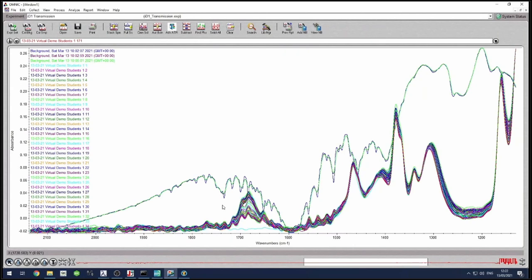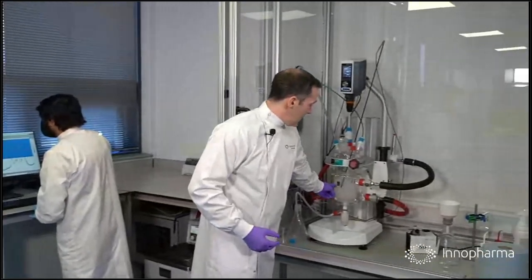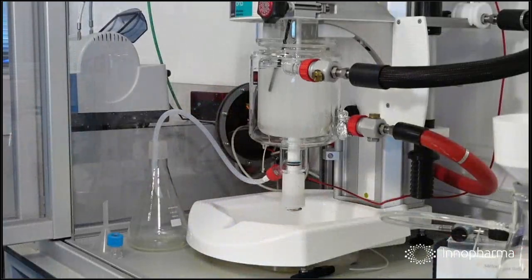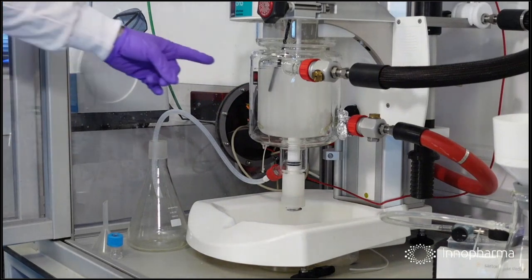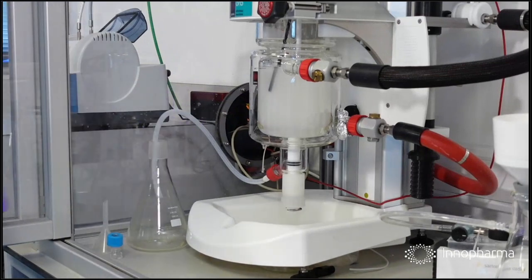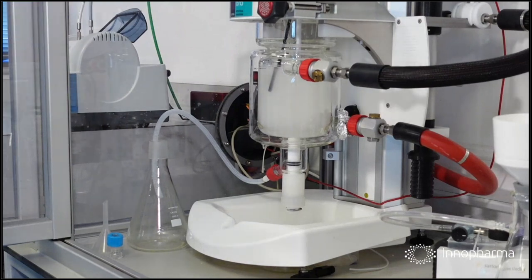While we're waiting for Kieran to bring that up for us, we might discuss what's going to happen next so that we can use this data to make a prediction based on today's experiment. But what we can see now is that the solution has become fully clouded. And what Kieran is going to do in a few minutes is to drain out the solution and all of the crystals present, and transfer this into a filtration apparatus.